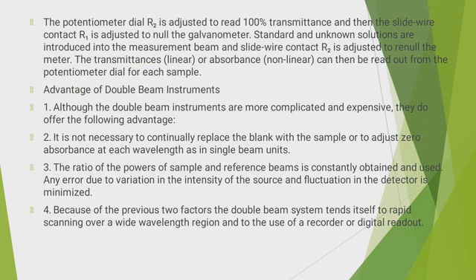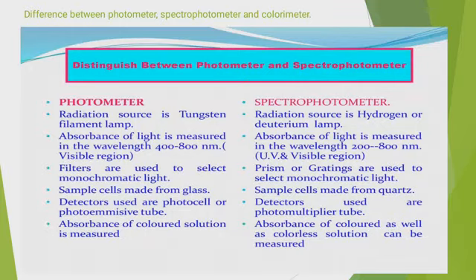I already told the advantages in the last lecture, so I am not going further on that topic. We start with the difference between photometer, spectrophotometer and colorimeter.